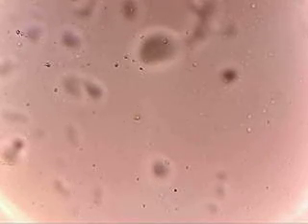Okay, see this one here? Bright boy right there in the center. If you look at them closely, you'll notice that there are actually bacteria stuck to him. They're spirillum, slow movers, and actually no movers because they're just spinning in place. You'll notice a few also in the vicinity of this one here in the center. What's interesting about it is they're actually swarming around that little blue-green algae there. Pay close attention. Their angles are aimed at him. Him, her, it, whatever.